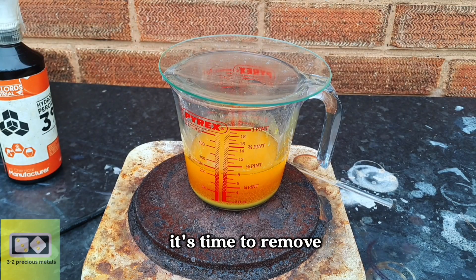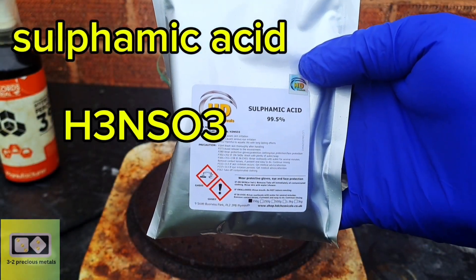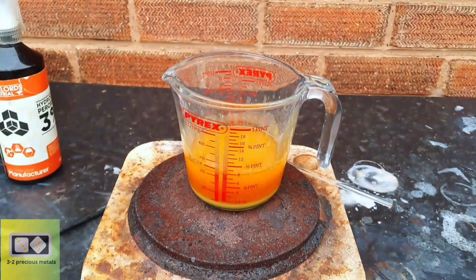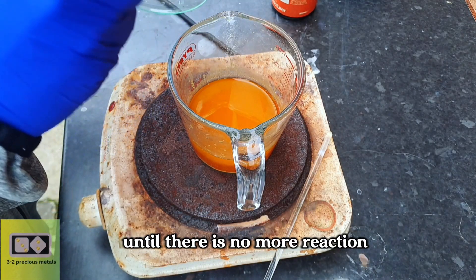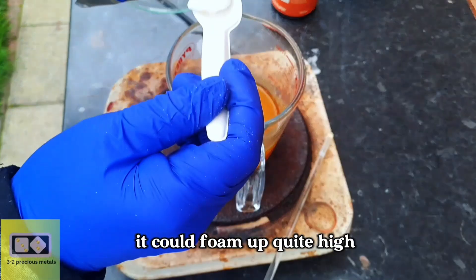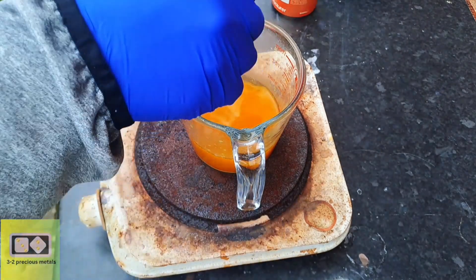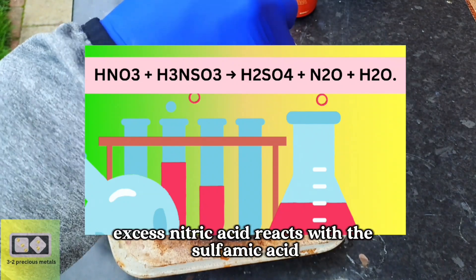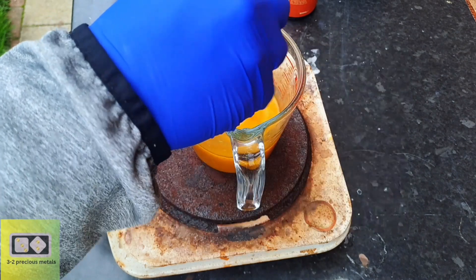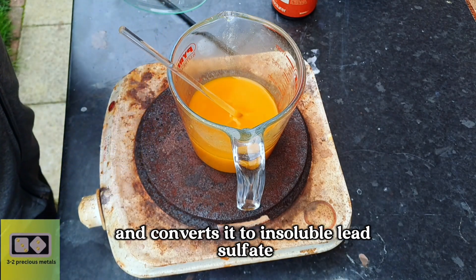Now that all of the gold is dissolved, it's time to remove any lead that might be present in the solution. For this, I'll be using sulfamic acid. For sulfamic acid to work, there must be an excess of nitric acid in the solution. Just throw in a small amount at a time until there is no more reaction. Be aware that if there is a large excess of nitric, it could foam up quite high, so make sure to use a large enough beaker to allow for the reaction. What's happening is that the excess nitric acid reacts with the sulfamic acid to produce sulfuric acid, nitrous oxide, and water. The sulfuric acid that is produced then reacts with any lead chloride in the solution and converts it to insoluble lead sulfate.